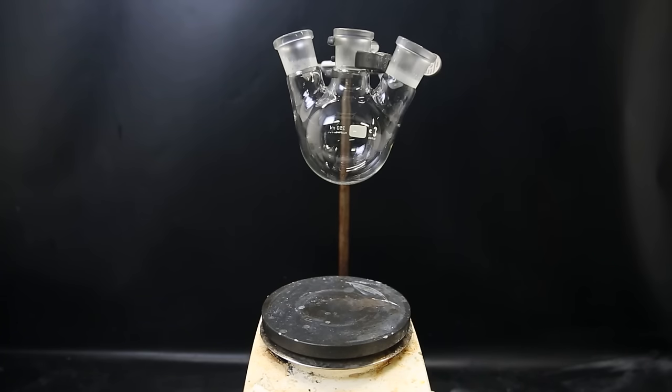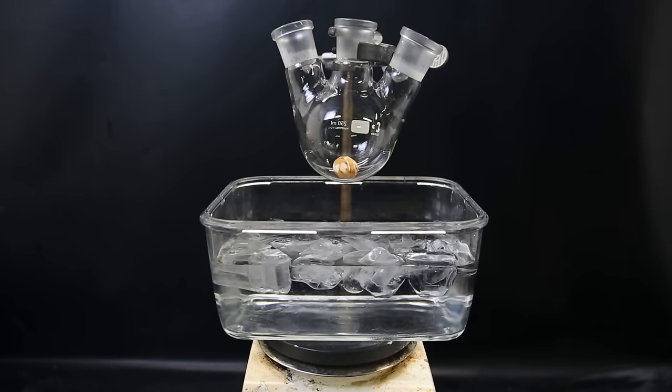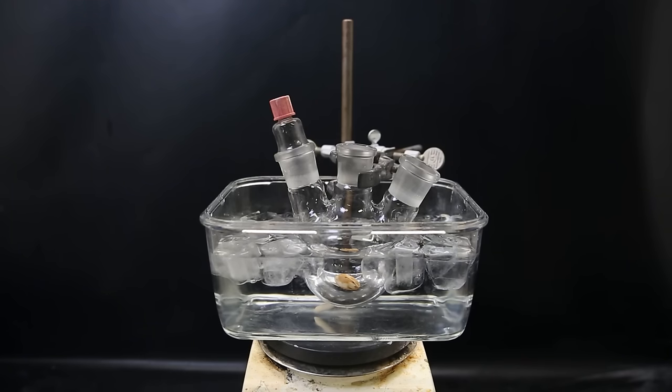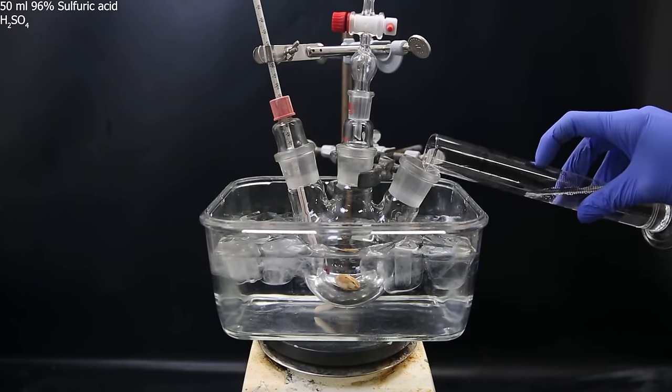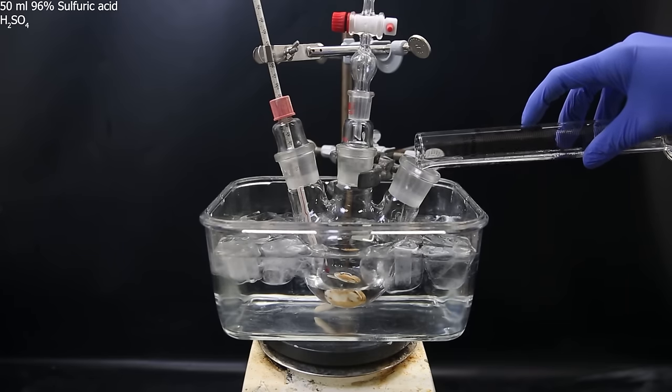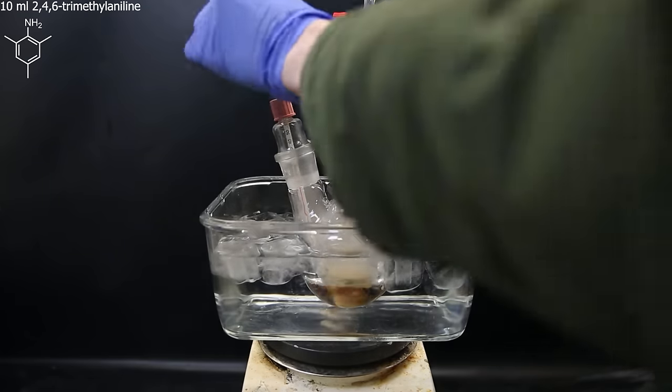So to get started, I set up a stir plate and a flask with a stir bar. I then set up an ice bath and submerge the flask into it. I attach a thermometer to keep track of the temperature and an adapter with a small dropping funnel. I then add in 50 ml of concentrated sulfuric acid and 10 ml of 2,4,6-trimethylaniline.